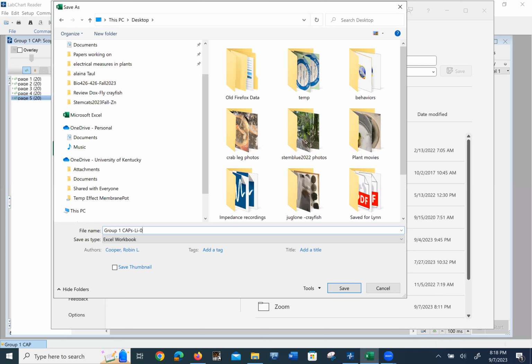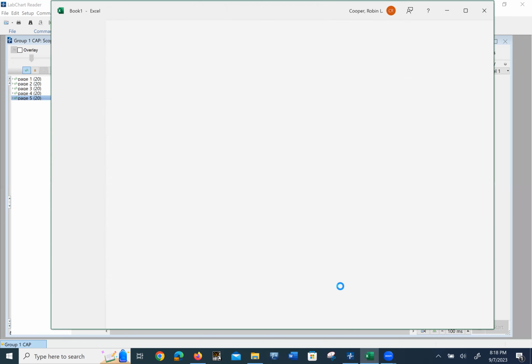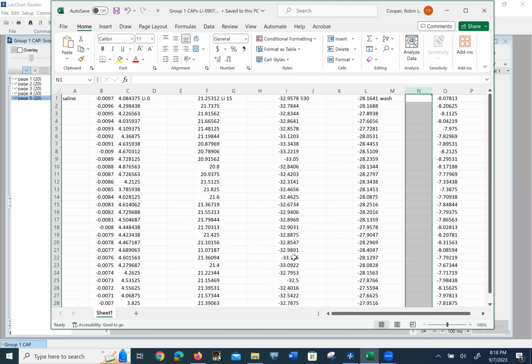Today's date was 09/07-2023. Remember, when you name something, don't use dots. You can, especially on a Dell. I think Macs can handle it, but IBM can't use dashes. Okay, so we copied that just for safekeeping.